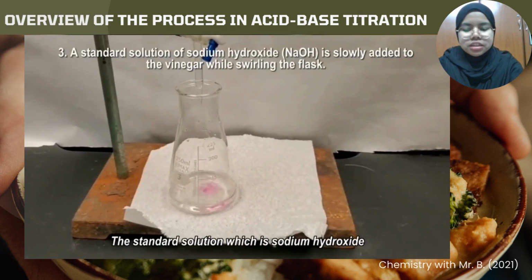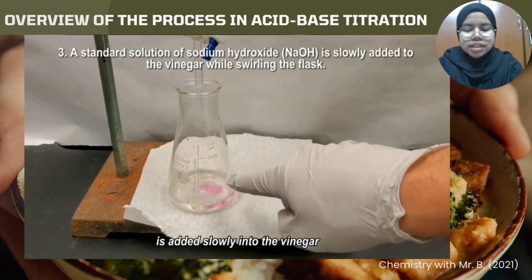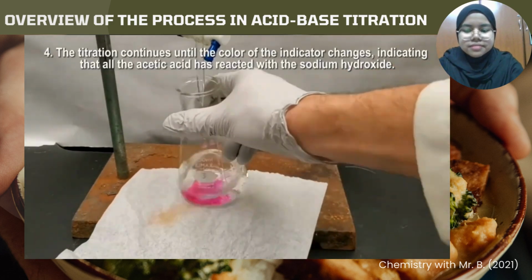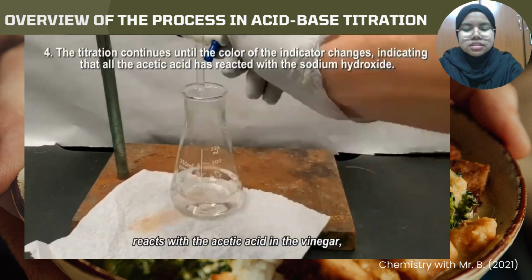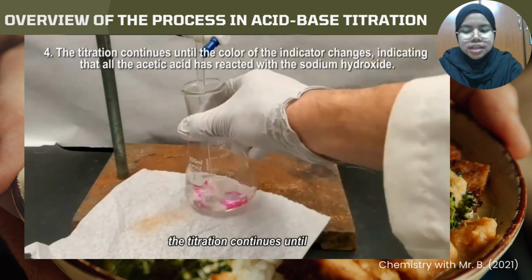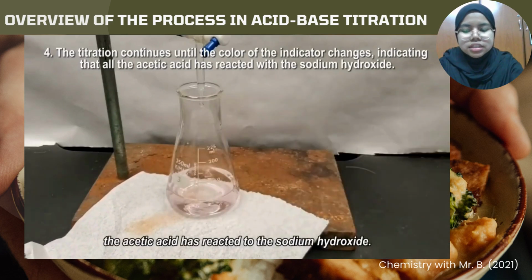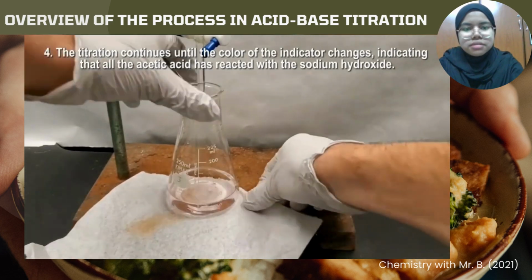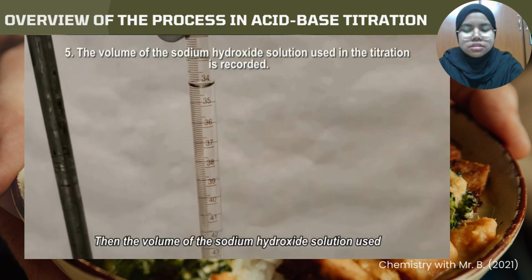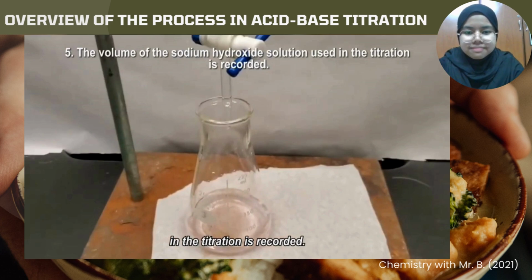The standard solution, which is sodium hydroxide, is added slowly into the vinegar while we stir the flask. As the sodium hydroxide reacts with the acetic acid in the vinegar, the titration continues until the color of the indicator changes, indicating that all the acetic acid has reacted with the sodium hydroxide. Then, the volume of the sodium hydroxide solution used in the titration is recorded.